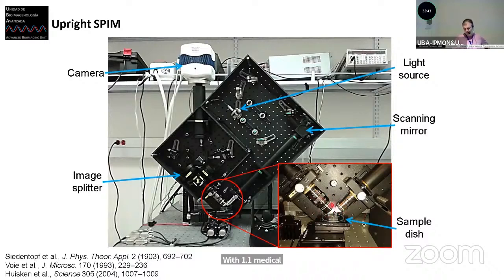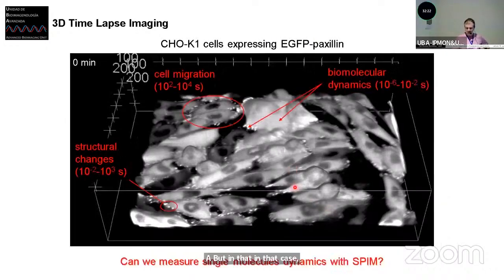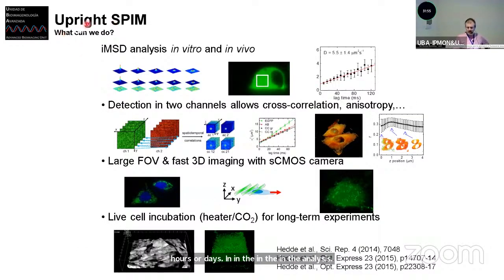And as you may notice, this has a lot of constraints on how to put your sample there, right? You need to rise up your dish, and you need to rise up your cells in order to make it at the point where the two beams, excitation and collection, converge. But in that case, he was still able to use this to study the dynamics of cells. In the dynamics of cells, you can see formation and deformation of focal adhesions. You can see cell division, different time scales that enable you to go from millisecond time scale to hours or days in the analysis. Nick used this particularly to measure the diffusion, to measure the cross correlation, so interaction between molecules, in vivo.